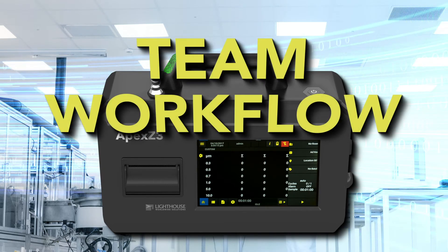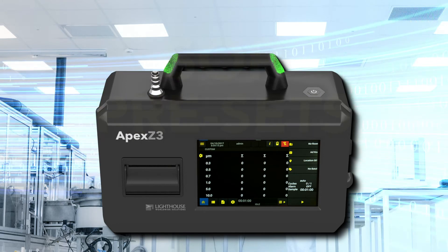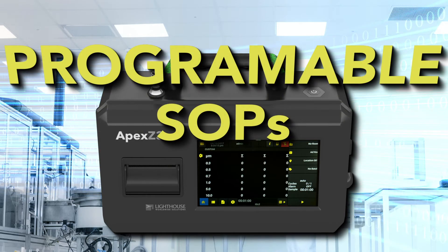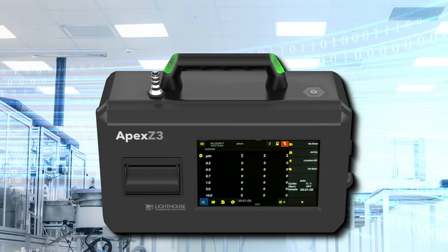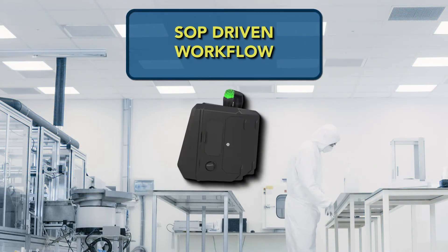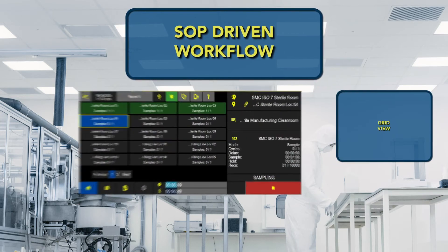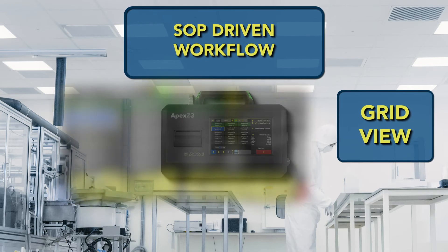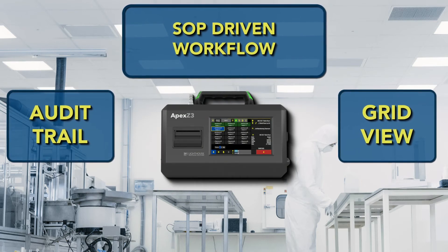Manage your team's workflow to mitigate against management or operator sampling errors. Use validated SOPs and program the sampling SOP details directly into the Apex Z so your cleanroom technicians can take the guesswork out of their daily sampling. With SOP-driven workflows, all the operator has to do is take the samples in each room. Our grid view feature allows you to see exactly the workflow status and each sample in detail. All activity is captured by an audit trail so the integrity of the sampling data is fully intact.